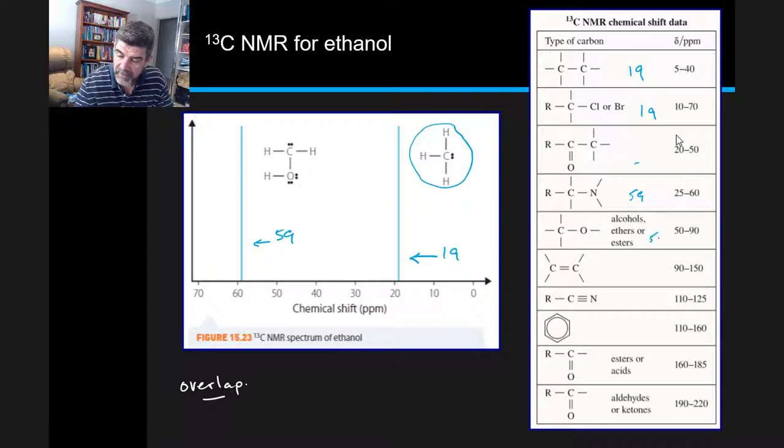this one, and then we're all right after that. So again, we've got two options that we can look at for the peaks that have occurred here. So again, what we know is that we're looking at ethanol. So we are looking at this hydroxyl functional group right here.